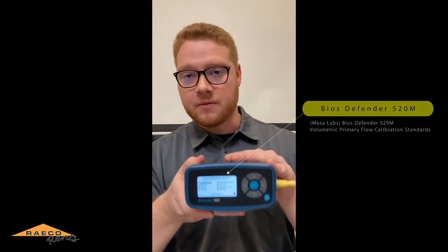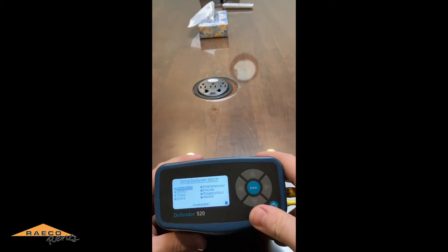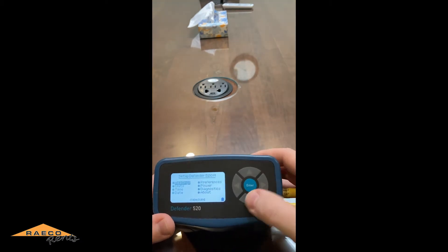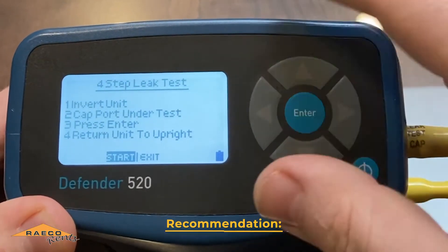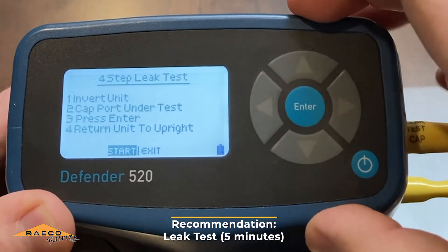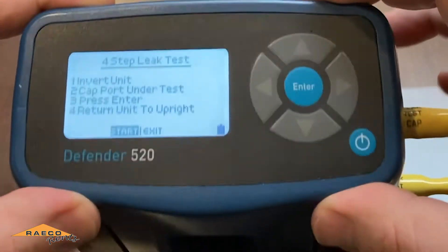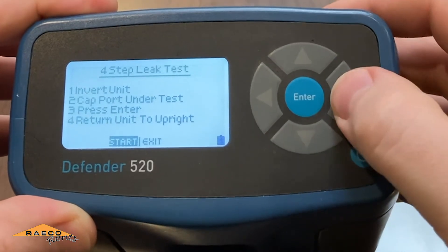This is the BIOS Defender 520. First, let me show you a few things with the BIOS Defender. One of the things I recommend is to go into the diagnostics and do a quick leak test — it takes maybe about five minutes. This is just to test the basic functionality of the calibrator and make sure there are no leaks, because that will affect your ability to take calibration measurements.